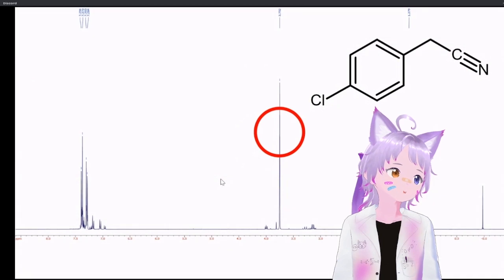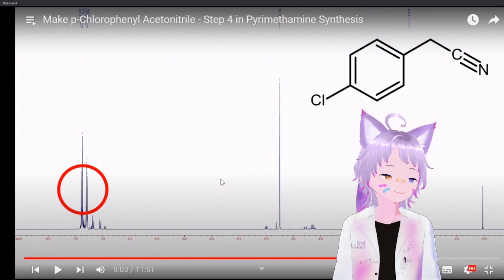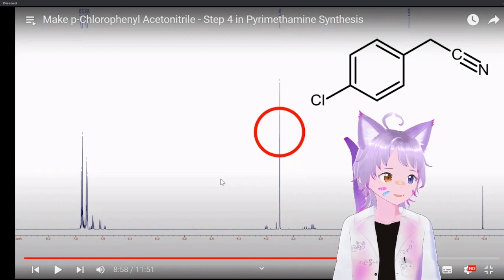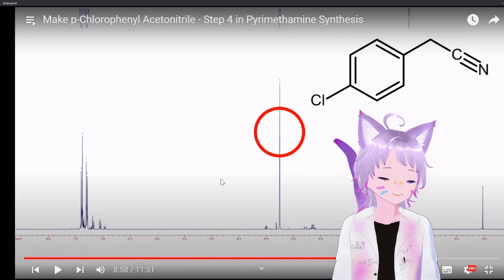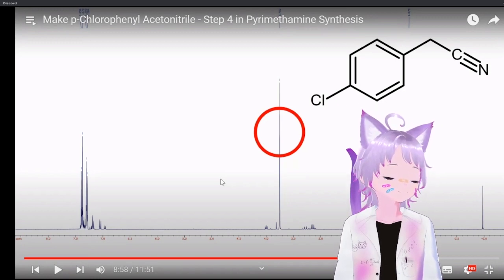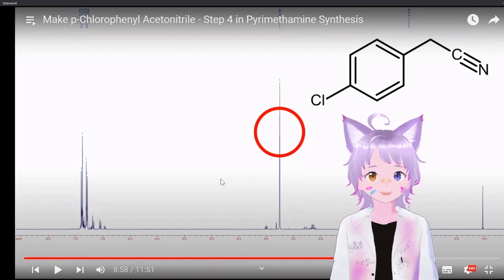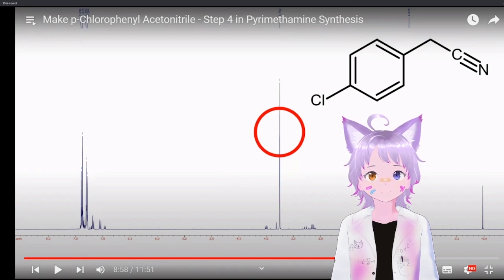Okay, so we now have a better purification step then. Instead of very low temperature or super temperature control to make large crystals, we could technically just wash it with dilute hydrochloric acid to get rid of that benzylamine, right? And then we just recrystallize it, put it in the freezer, vacuum filter and call it good, and that should get rid of the acetone, if there is still any in there, or if it will even.